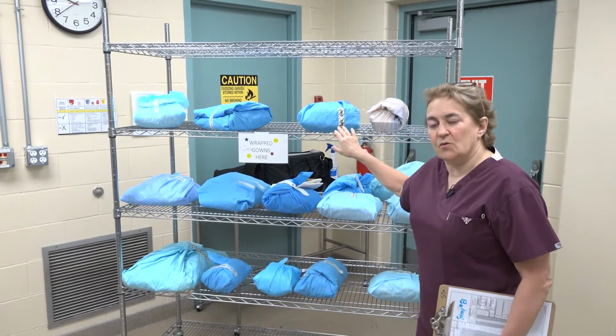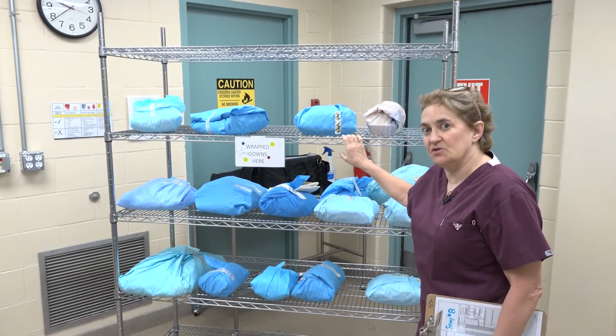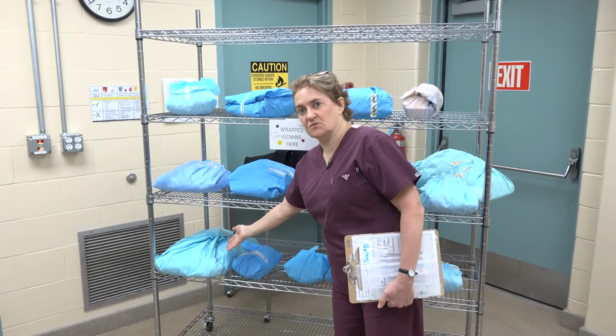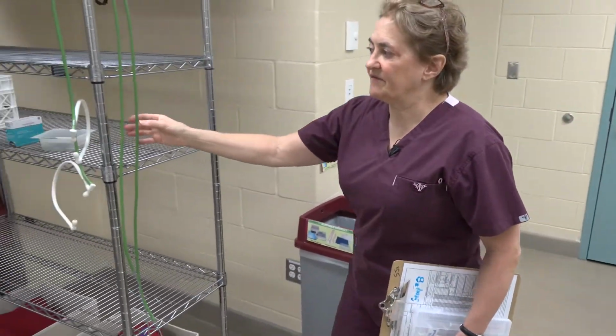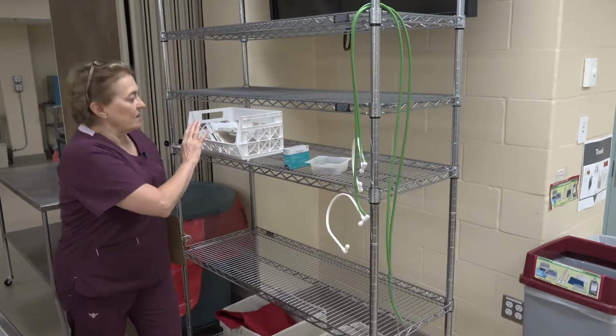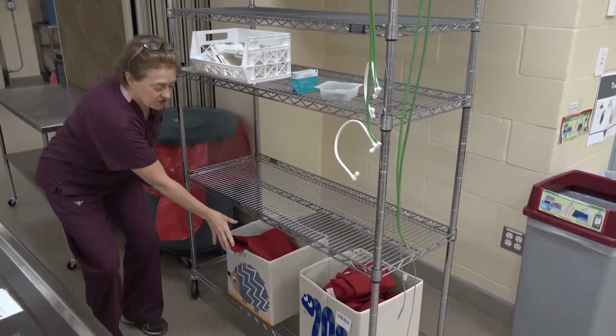Okay, this is the rack where you'll find your sterilized gowns, so make sure you put your names on them so you can find them. And also your surgery packs will be here as well. And over on this table, you'll find esophageal stethoscopes, gloves, blades, suture, and your bed jet.